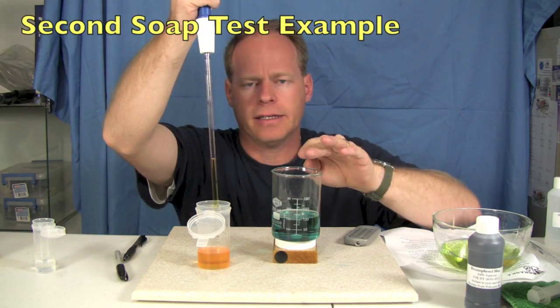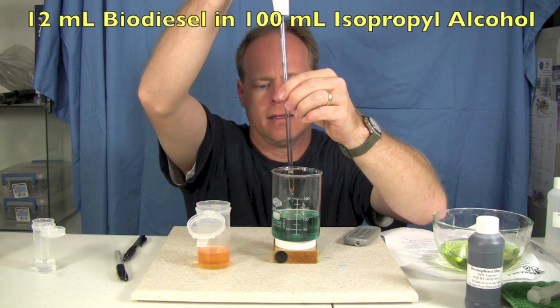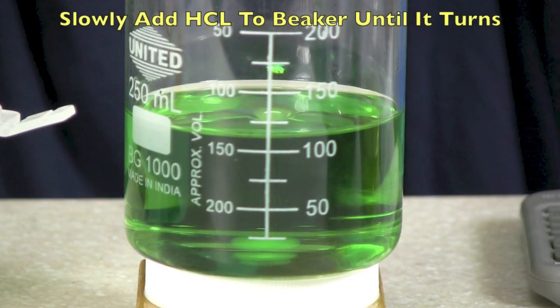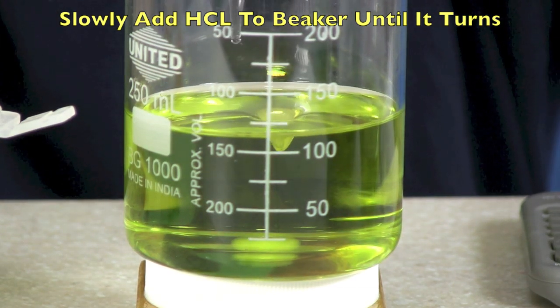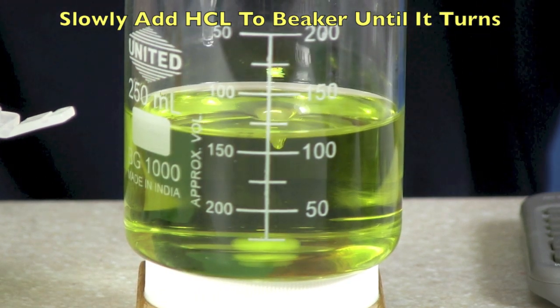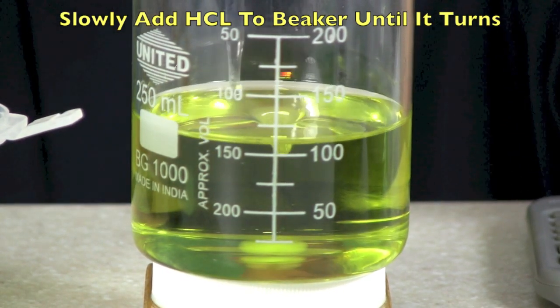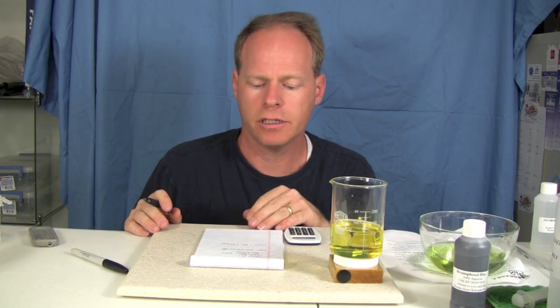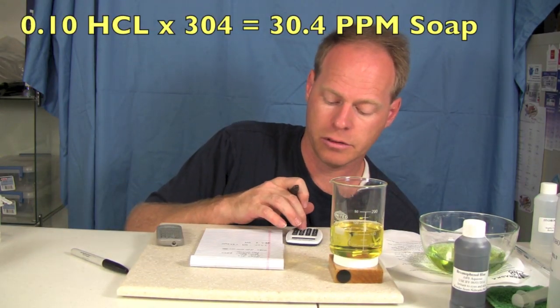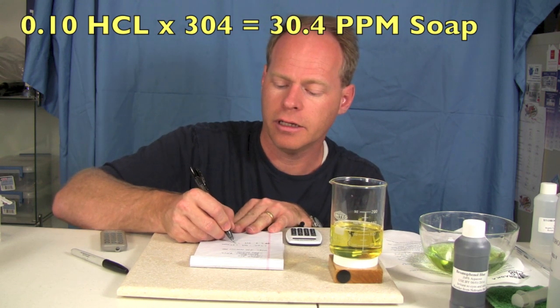This is another batch of biodiesel we're going to test. I have my jar prepped and I'm going to put 12 milliliters in here and then we'll go ahead and test it. This is turning yellow almost instantly — wow, look how quick that went. To figure out how much soap is in this we're going to multiply: 0.10 times 304. This is even cleaner fuel, coming in at 30.4 parts per million.